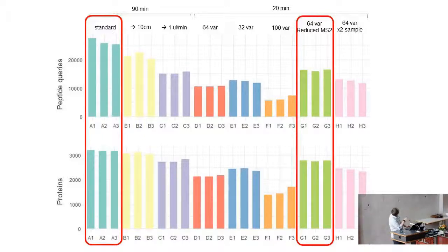We don't get so much loss of proteins, and if we look at the best method here, the most optimized SWATH method, this is now in this 20-minute gradient. At the protein level, we can get roughly 80 or 90%, probably 90% of the proteins that we saw in the prior methods. So we were reasonably happy with this, and we said, okay, let's try the real thing now in the Evosep.